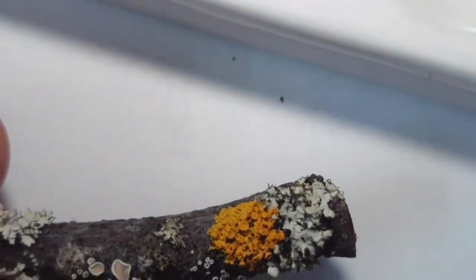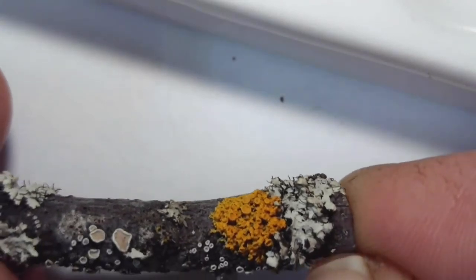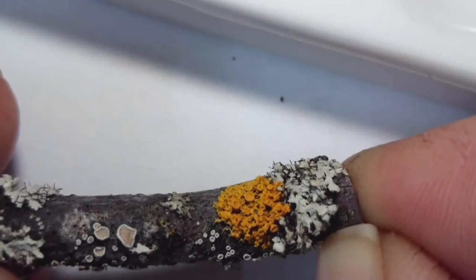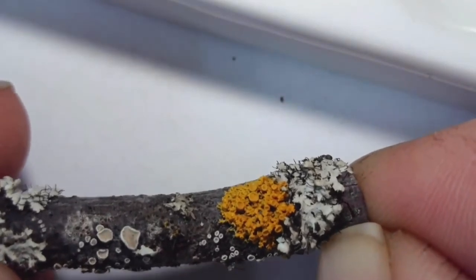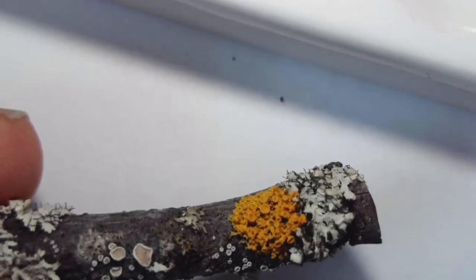be Candelaria. You can kind of get a feel for those two genera in the field without the K test, but it can be hard sometimes. Usually Candelaria, though, isn't quite as orange as this, has more of a lime green color, so I suspect that this is either Xanthoria or Xanthomendoza, but let's just go ahead and test it.